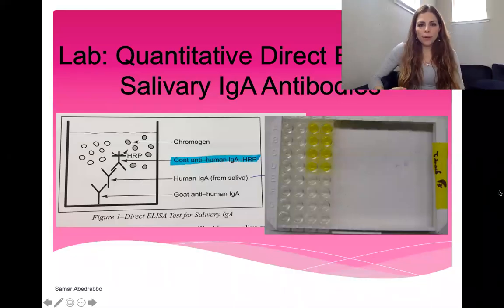Hi everyone, I'm going to explain the ELISA experiment in this video, and I really wish you guys were doing this experiment in lab because this is one of the experiments that's being done for detecting coronavirus infections right now. There are multiple tests that labs are coming up with to detect if people have the novel coronavirus, if they're infected with it, and ELISA is one of those tests.